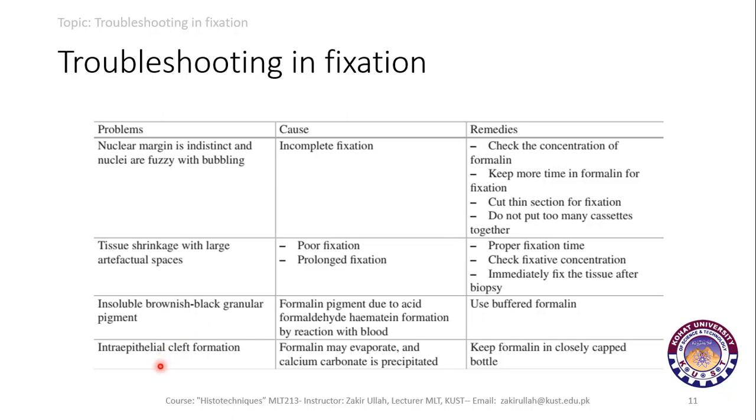Intraepithelial cleft formation is the last problem which is discussed today. This is caused by the formalin which may evaporate, and the calcium carbonate is precipitated. So, to resolve this issue, we must keep the formalin in a tightly closed bottle so that the formalin does not evaporate.